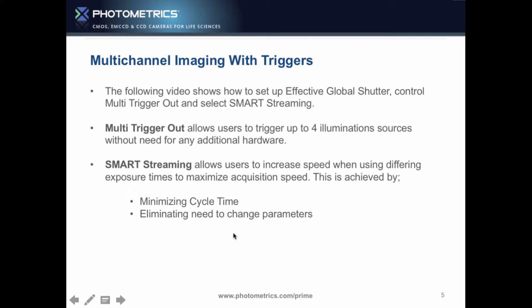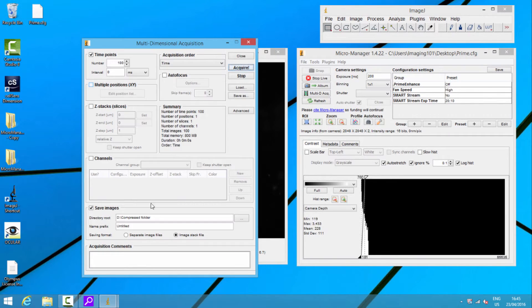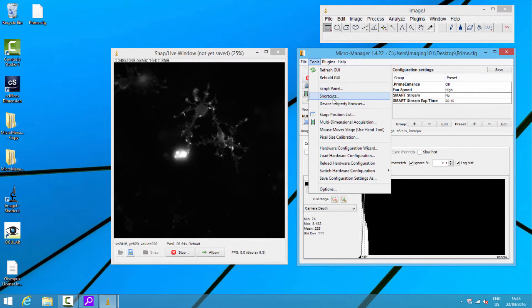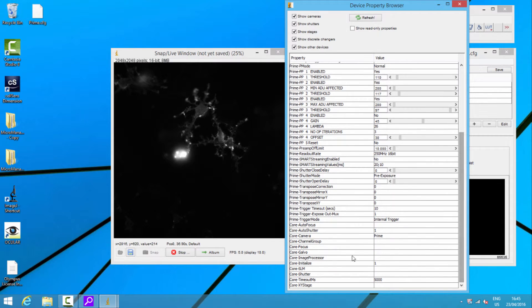Let's have a look at setting this up inside Micromanager. We're running live — we have a 200-millisecond exposure time and an image up of one channel. Normally inside Micromanager, we'd go to the multi-dimensional acquisition and set up a couple of channels — that normally runs at about two images a second or so. But now we're going to turn on all rows — that's our global shutter mode — and then set up the multi-trigger out.